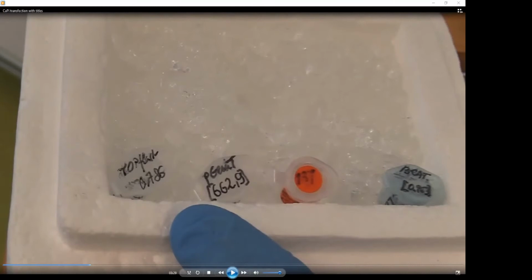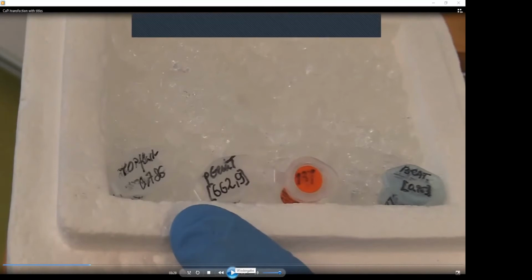Important is to note the correct concentration of each sample, so that you know the real concentration in your stock, and you can calculate how much you have to pipette. So what you see here is the top flash. This is the reporter for Wnt signaling containing 4 TCF4 binding sites and the luciferase gene.